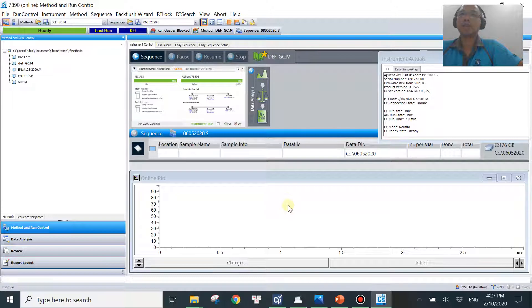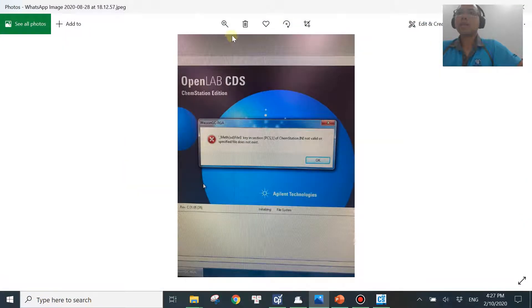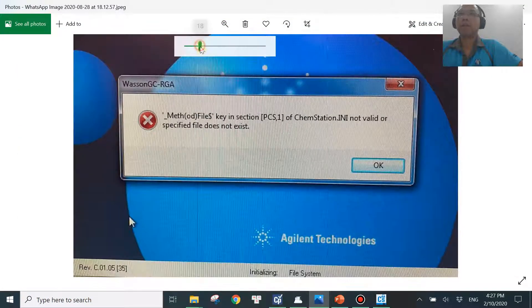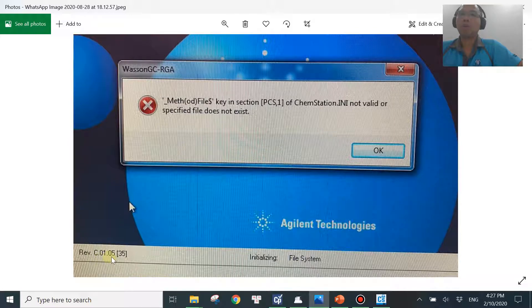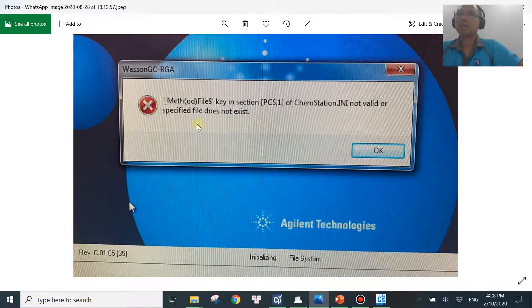In many cases you will be using older versions and the error message will be a little bit different. Let me show you another one. This is a very common error message — basically the same issue but the message is worded differently. The version shown is C01.05 and it will say the method file 'dollar key' in section PCS1 of ChemStation ini is not valid or does not exist.